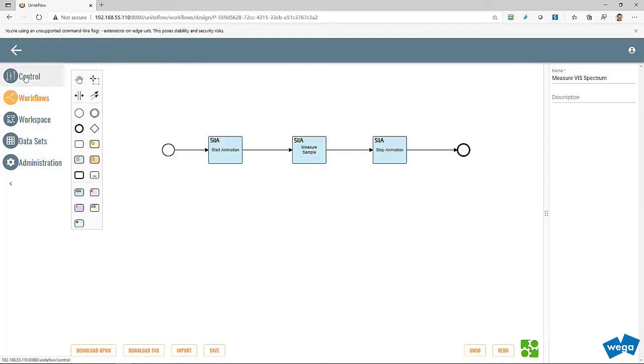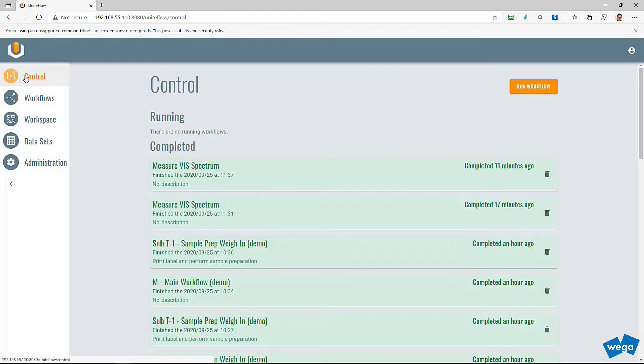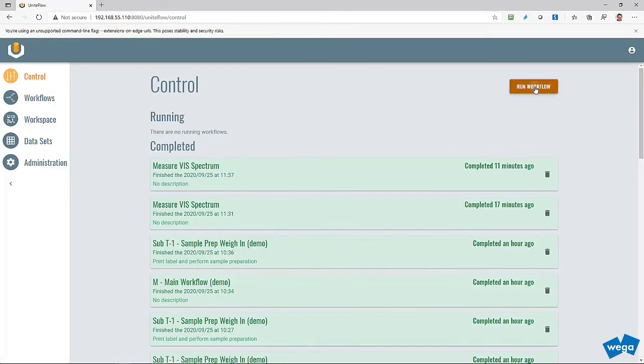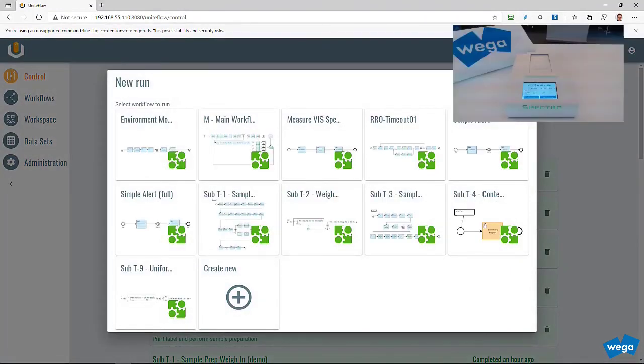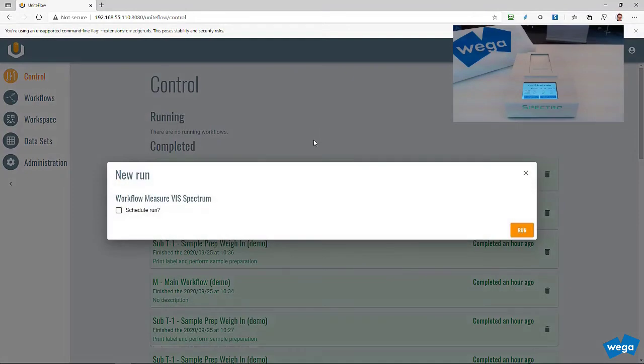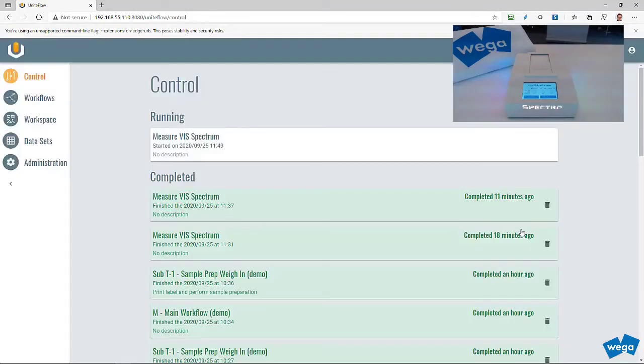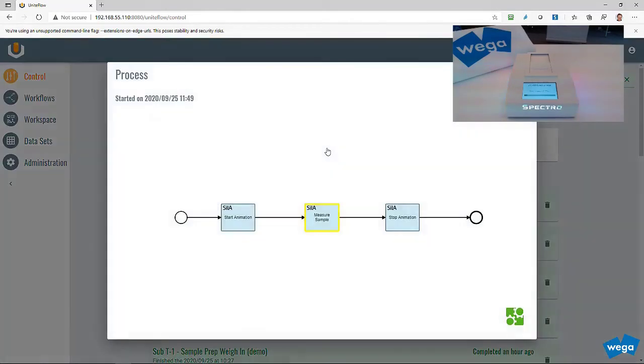We are now ready to start the workflow and measure the sample. The measurement is visually supported by the LED animation.